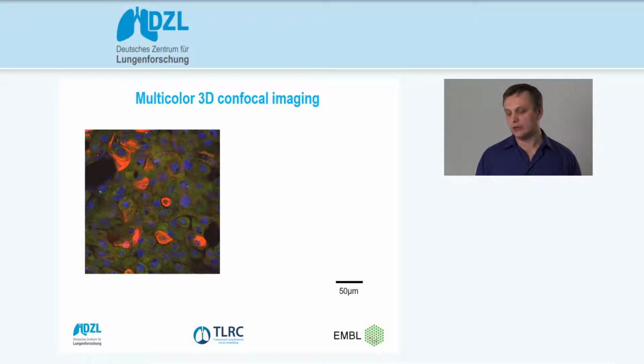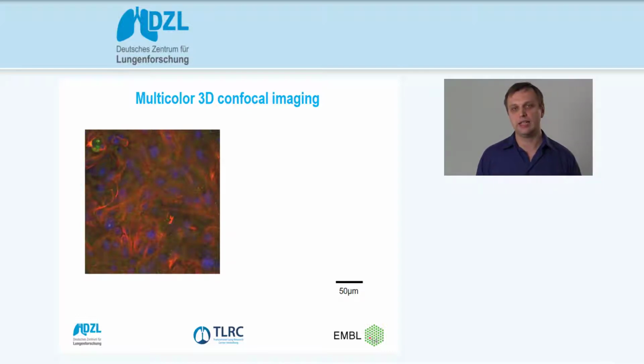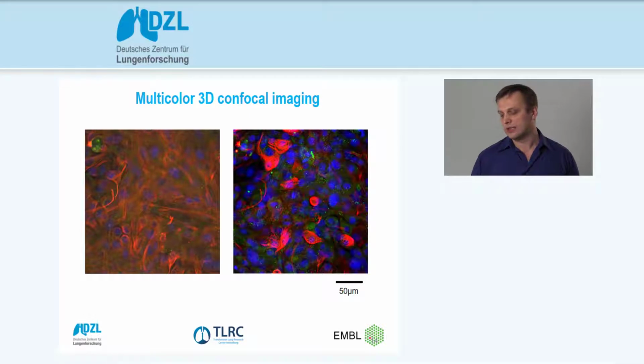What we can see is that in this sample we see different cells in different layers, and this information we would not be able to capture with standard epifluorescence microscopy. On the right part of the slide, we now see the superposition of all our individual images, which shows us the dense cells in our sample, but we cannot distinguish which cell belongs to which layer. Whereas from the individual slices, which we just saw in the movie, we can easily capture this information.